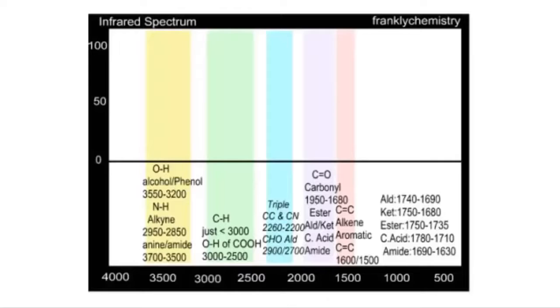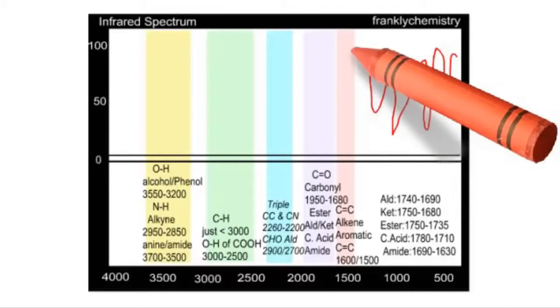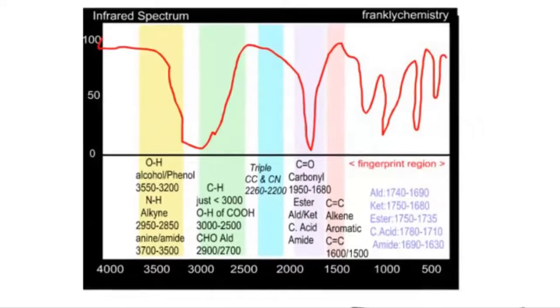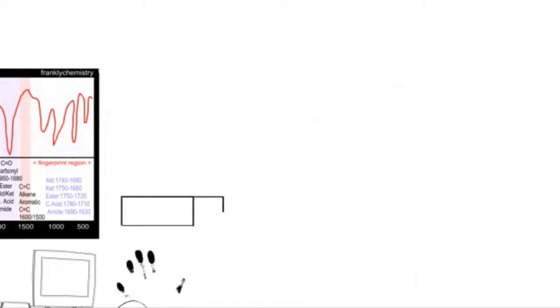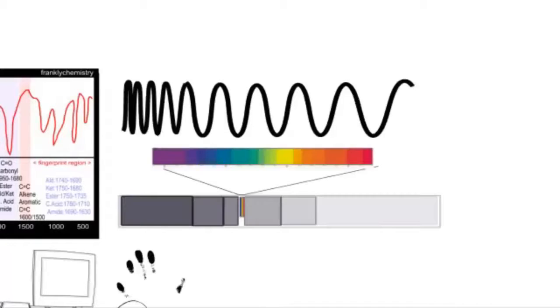Now when we turn to infrared spectroscopy, again we have a kind of fingerprint, but this time it takes the form of a graph like this. And here, instead of looking for arches and loops, we're looking at where these so-called troughs or peaks appear relative to the x-axis. Now let's consider where infrared radiation appears within the electromagnetic spectrum itself.